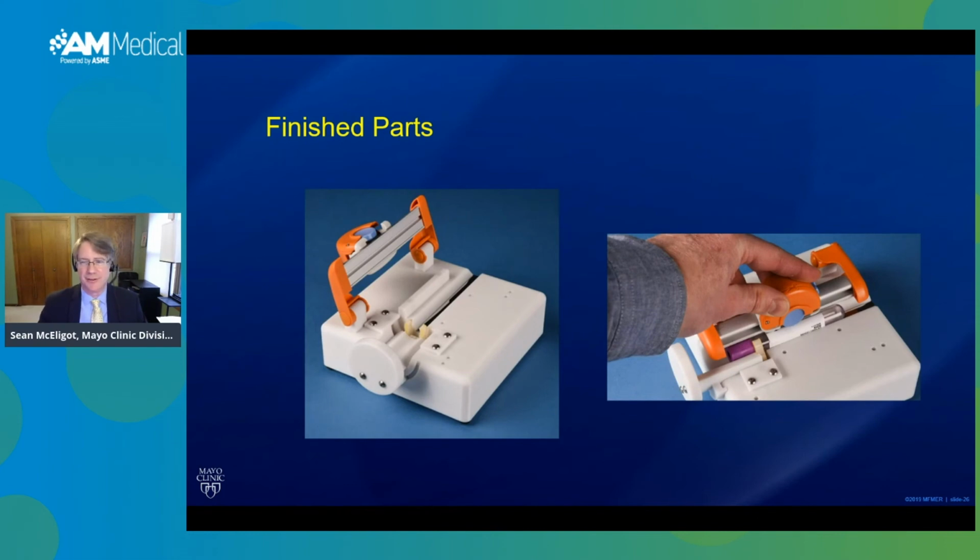This is actually one of my favorite 3D printing examples. It's a label removal tool. The Mayo laboratories, Mayo has a tremendous commercial laboratory. The laboratories needed to remove sections of blood vial label to support a $150 million grant. Some of the vials come in with labels covering the complete circumference of the vial. When you're getting 6,000 vials in a day, even a small percentage turns into a large number. This interferes with the first step of testing, optical analysis of blood components after centrifuging.